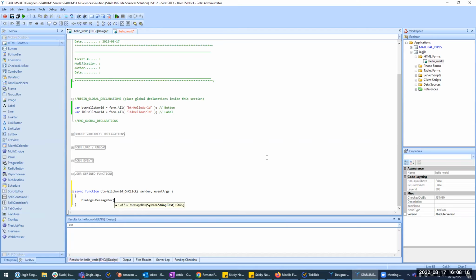Okay, now more help from IntelliSense in the designer. So 1 of 5. Scroll through some of those. Okay, go back to number 2, please. So the System.String, a text, and then a caption. If you put two parameters, you can give the message box a caption. Okay, keep going, 3 of 5.